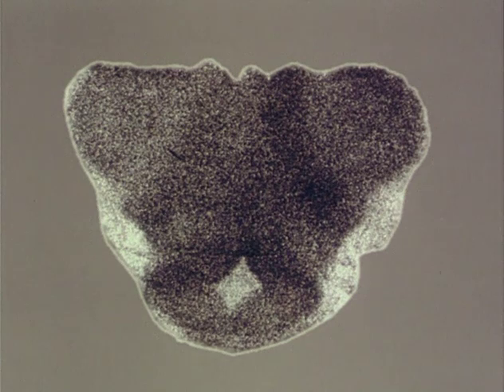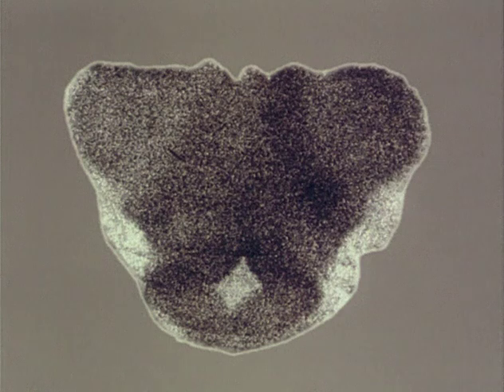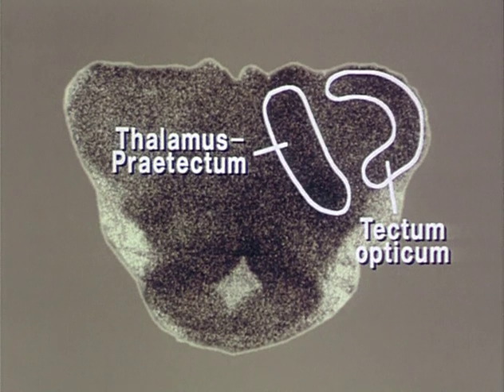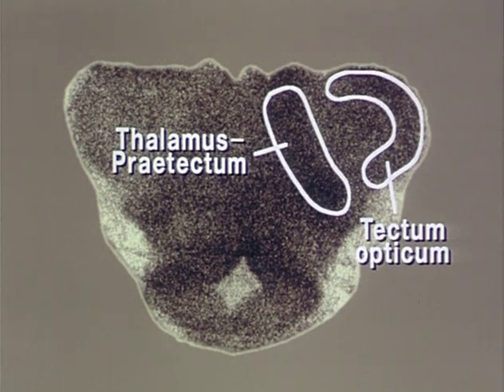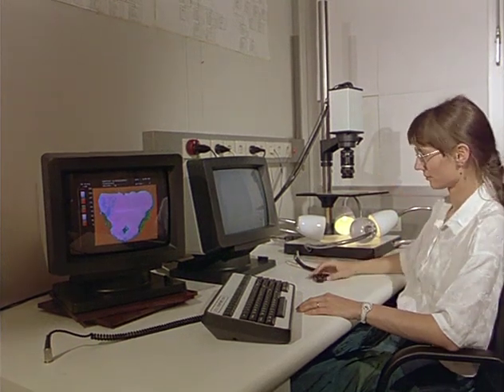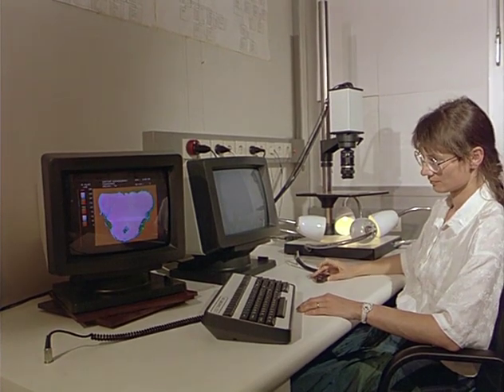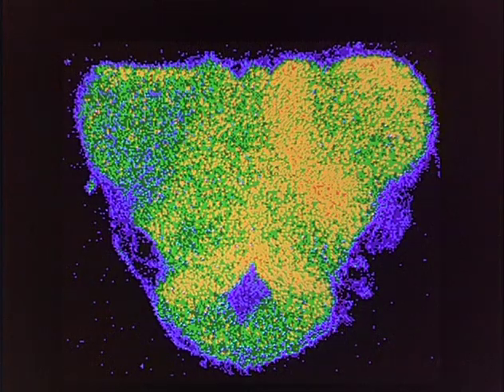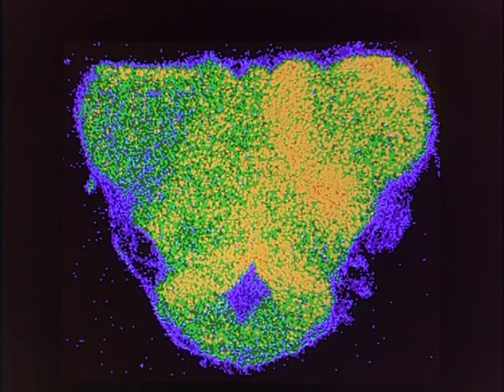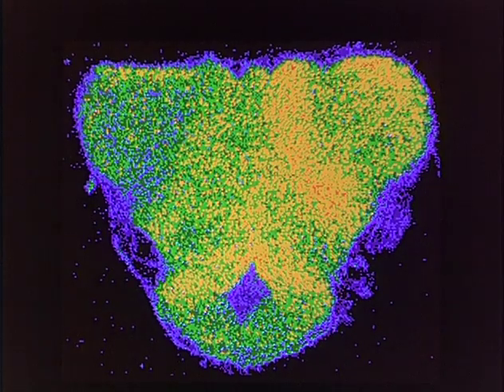Regarding the radioactivity, the neural activity was somewhat higher in the right brain hemisphere, but a differentiation between optic tectum and pre-tectal thalamus can be hardly detected. With the aid of a computer, the autoradiographic image can be analysed stepwise and colour-coded. In the code chosen here, the radioactivity increases in the direction of warm colours. According to the hypothesis, during presentation of the anti-worm stimulus, the pre-tectal thalamus is clearly stronger activated than the tectum.